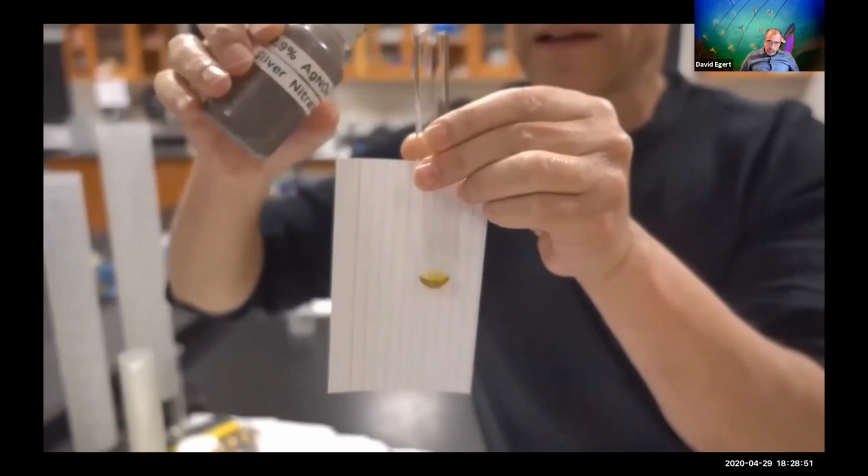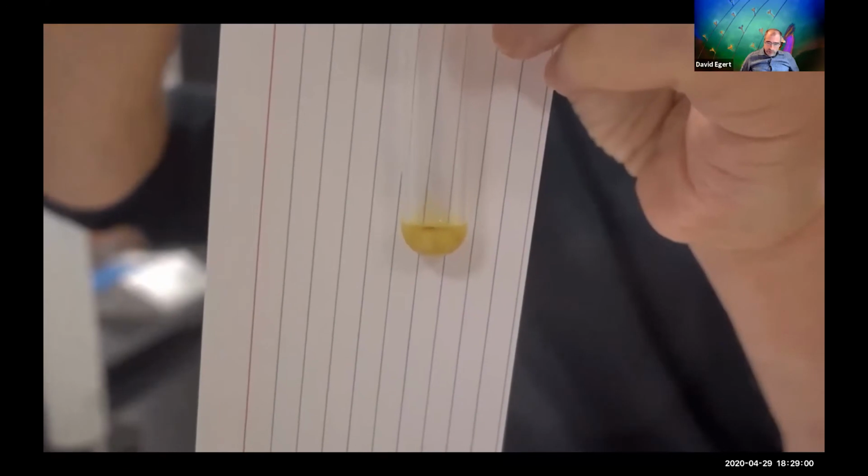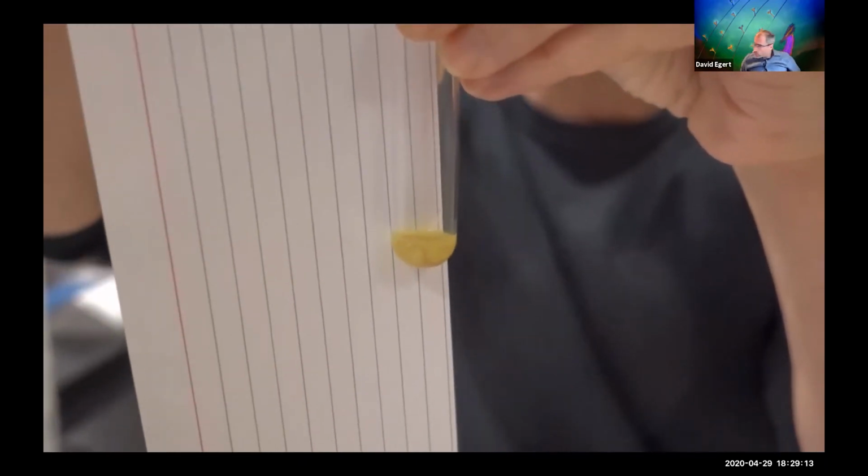Okay, I'm going to add in a drop. Do you see little browns show up? And then 2, 3, 4, 5, 6. I need to kind of look at it. Still looking. 7, 8. Oop, it's not staying brown. 9, 10. Not quite yet. 11, 12. Ooh, it's almost there. 13. I'd probably give it one more. 14. That's brown. So 14.